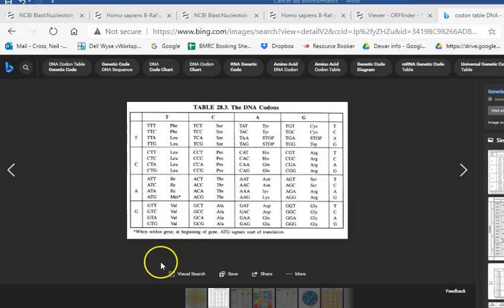And if we consult any random codon table that we can quickly identify by Googling DNA codon table, you can see here is a GTG codon coding for valine, and when that T is converted to an A, that's a GAG for glutamic acid. So we're absolutely sure that we are dealing with the right bit of DNA, and armed with this information, I would be very confident in ordering those primers and knowing that they would amplify the right bit of DNA, and then if I sequence that PCR product, I would have the V600E mutation site right in the middle of that PCR product.